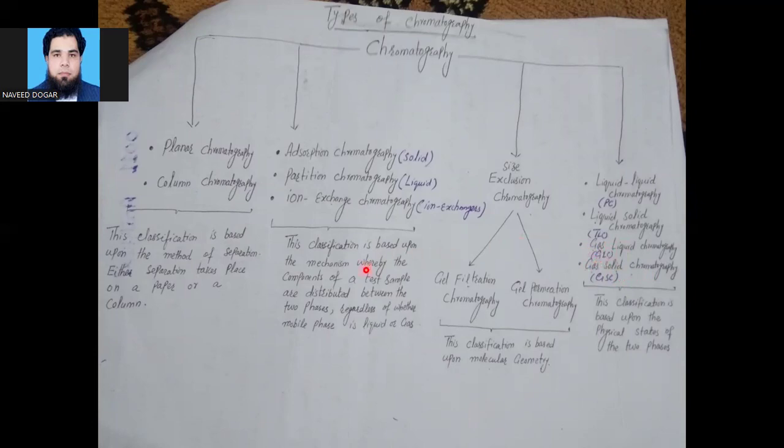So this is all about the types and basic principle of chromatography. I hope you get the idea. And in the next lectures, we will discuss paper chromatography, TLC, and other types of chromatography techniques in detail.